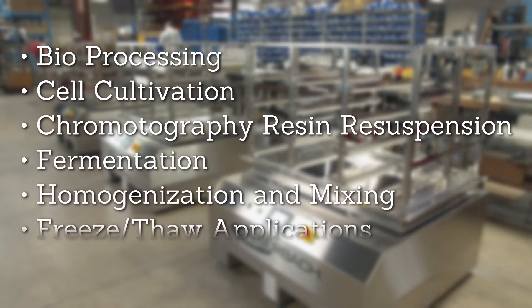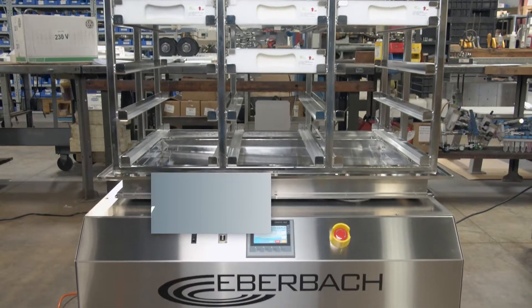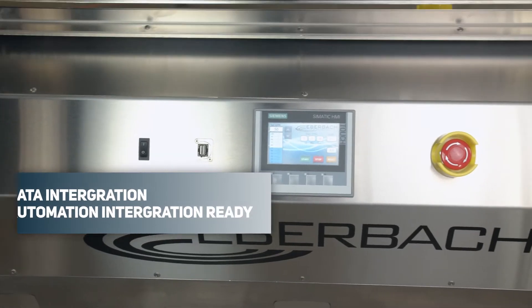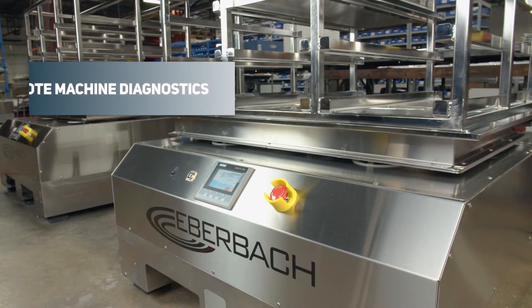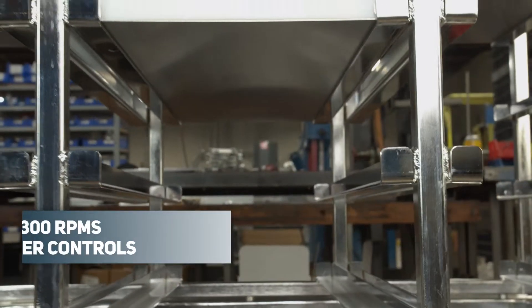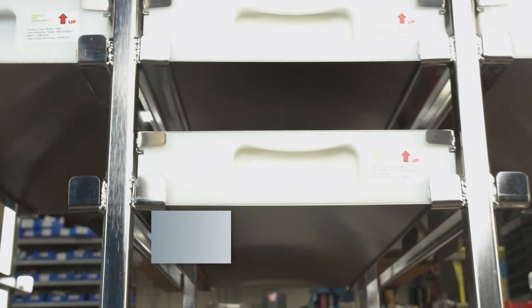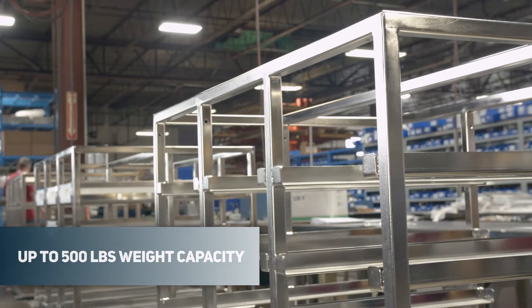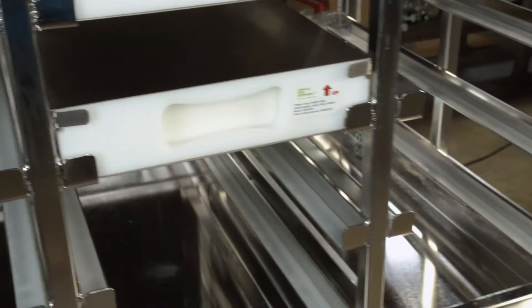Applications also include fermentation, homogenization and mixing, as well as freeze-thaw applications. Standard features include data integration, automation integration ready, remote machine diagnostics, speed settings from 30 to 300 RPMs, timer controls, with a weight capacity of 500 pounds. These shakers can also be CGMP suitable and wash-down ready.